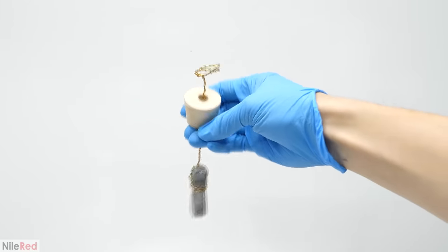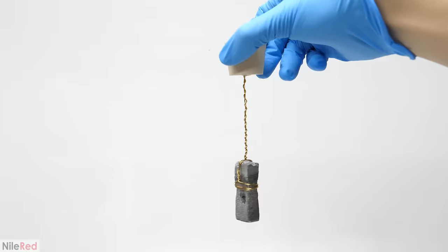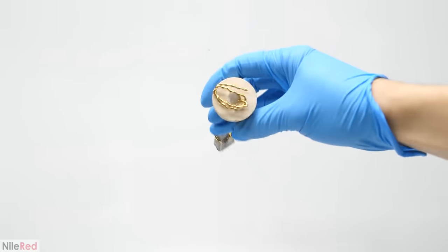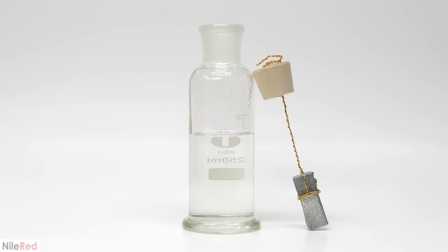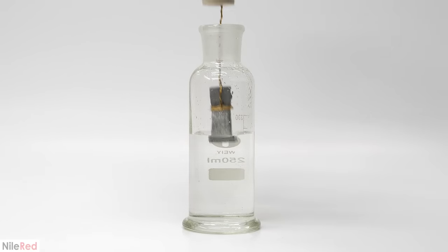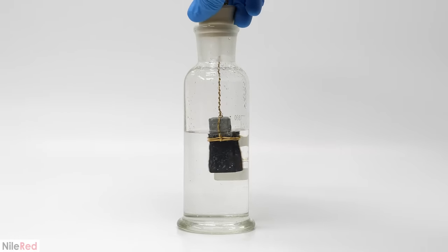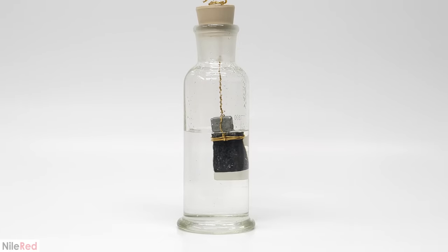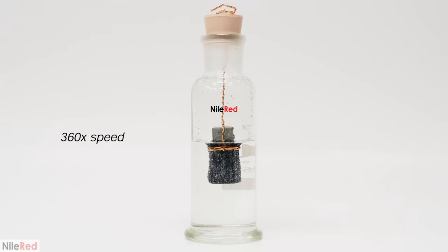So to set it up, I cleaned up the zinc again, wrapped it with some brass wire, and fed it through a stopper. Then I used some hot glue to completely seal it and fix it in place. For this run, I made twice the amount of lead solution — about 20 grams in 160 milliliters of water. When I felt ready to get started, I just lowered in the zinc and pushed down the stopper. It initially wasn't positioned very well, so I quickly took it out and re-centered it. I started a time lapse and then waited for the crystals to reach the bottom, which took about 72 hours.